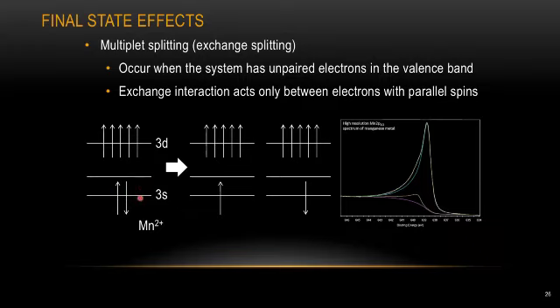The remaining electrons have a tendency to spin up or spin down, and you can observe this kind of multiplet splitting in the 2p spectrum. The data on the right here is the 2p spectrum for manganese. When we do some peak fitting, you can see we can fit a main peak right here, but somewhere about 0.9 eV below this main peak, we also see a slight shoulder peak, and this shoulder peak is due to the multiplet splitting.